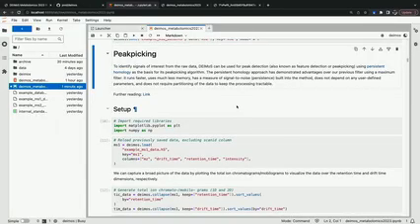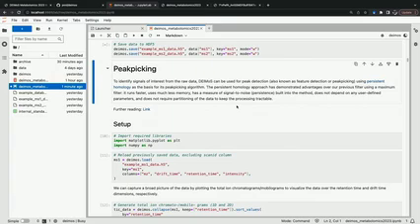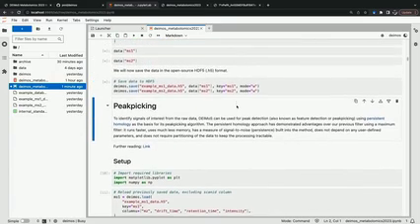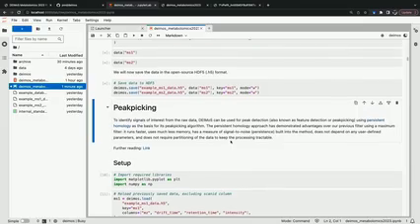You want to add something, Jess? For those of you who have read the DEIMoS paper, our initial approach to peak picking did involve local maxima. In addition to the improvements Christine mentioned, by switching to persistent homology, we no longer have to partition the data, which removes potential influence from edge effects, depending on how you were to cut the data to process it in its native dimensions. And so we have removed that from the current peak picking approach. Yep. Okay.